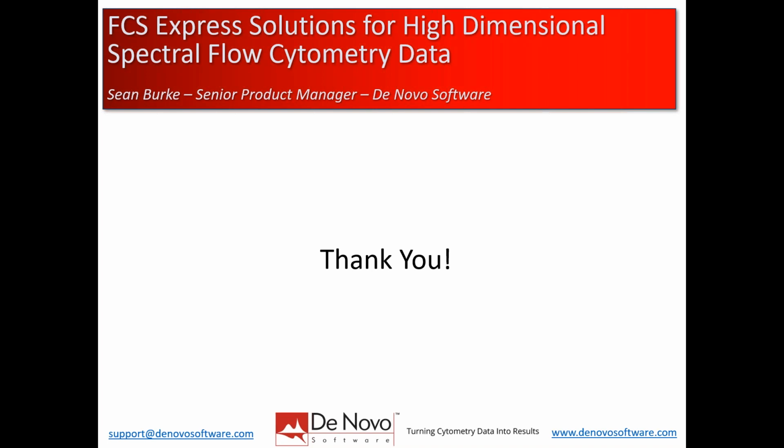So by default, FCS Express supports percent gated, percent of parent, percent of grandparent, percent of great grandparent. If things are starting to fall outside those norms, you can custom calculate any sort of Boolean gating combination that you want. And don't forget, you have the power of spreadsheets. So if you drag in the number of events for one population and the number of events for another, you can just use it like you would in Excel to create a new custom ratio to calculate a percentage of anything else. But again, a lot of that's available just by default.